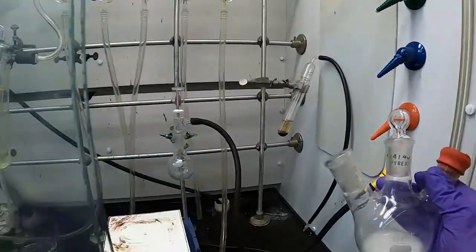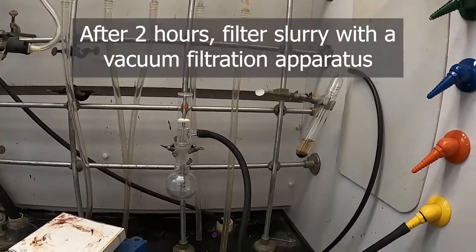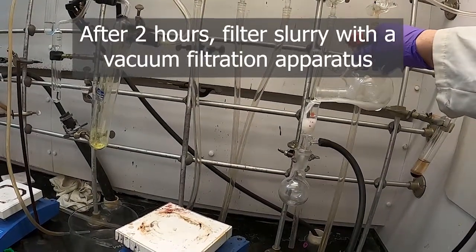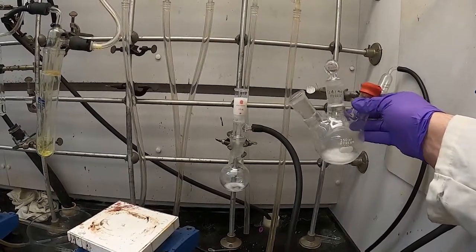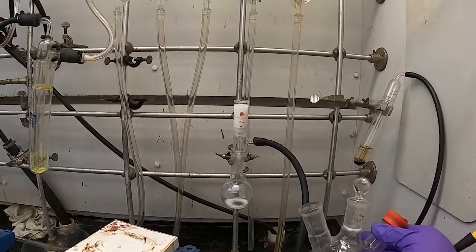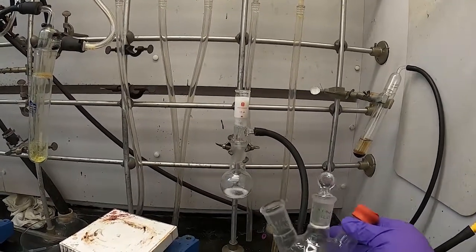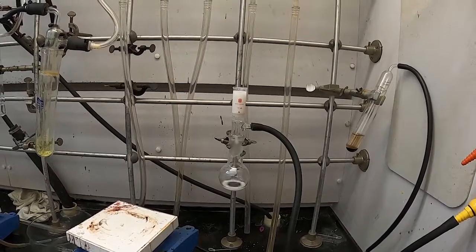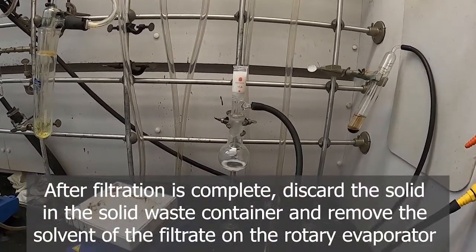This over here, where I've got a round bottom flask set up with a fritted funnel. And so we'll start up the vacuum. So we're going to be retaining the liquid this time, not the solid. So we've got to evaporate off this solvent now, which we'll do with the rotovap once we've filtered off the solid. Alright, so I'll let that filter through, and then I'll bring us back when we're ready to get this on the rotovap.